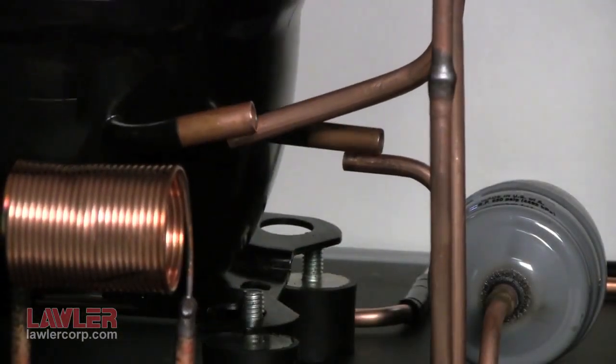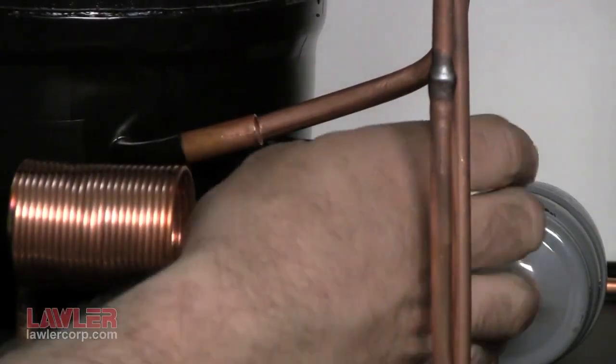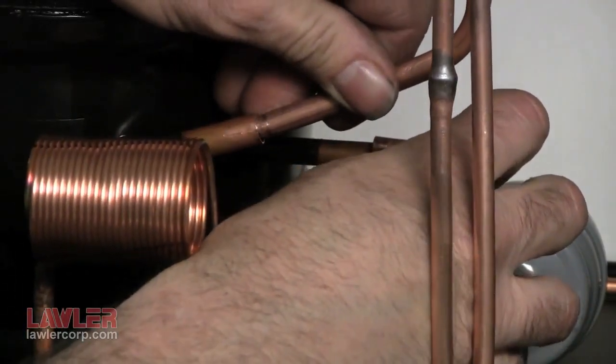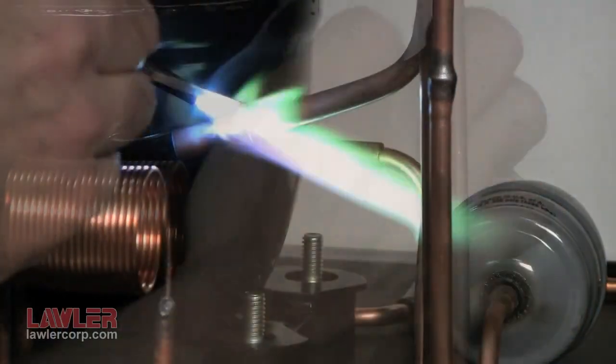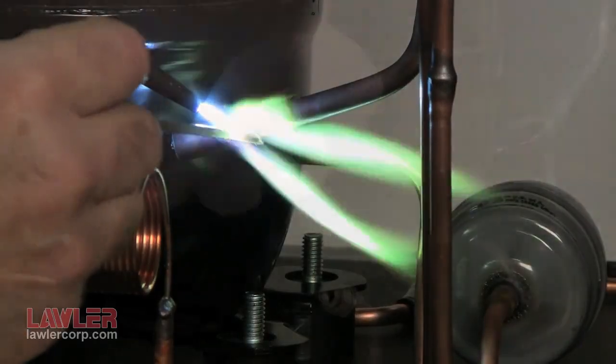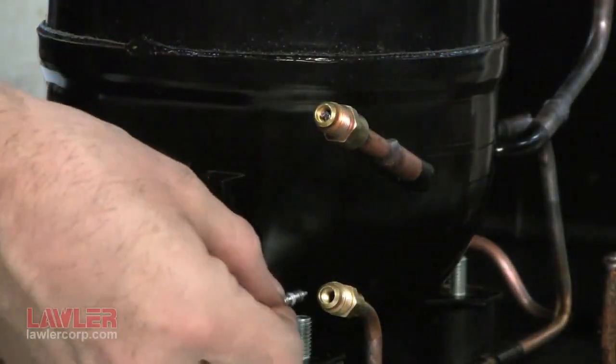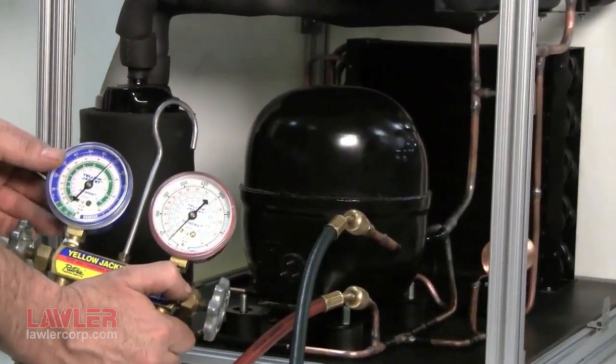The heart of each analyzer is the Lawler made refrigeration system based on over 65 years experience. We carefully select each component, then we handcraft and tune each refrigeration system. Our refrigeration technology is specialized for the petroleum laboratory market and built for durability.